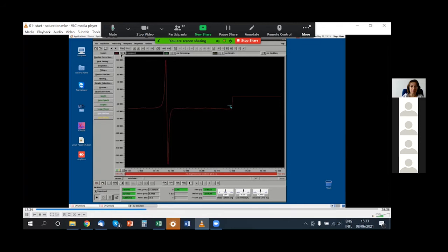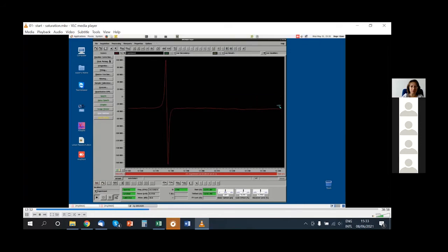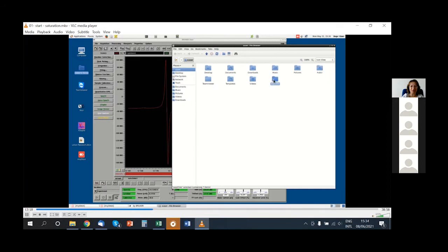So it's always an interaction with the spectrometer. You never have the situation to just put the sample and just do a measurement. You need several hours to interact with the spectrometer until you get the best results.